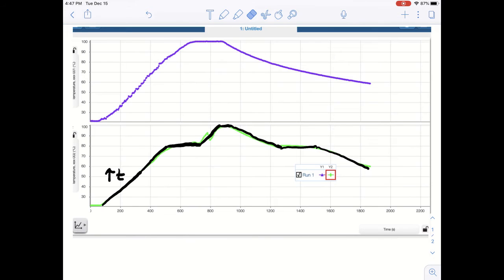But that's all thermodynamics stuff. So the motion of the particles is increasing, but we get to a point right here where the particles cannot speed up anymore and be in the solid state. So as we continue to pump energy into it through the water from the hot plate, the water keeps right on going because it's not undergoing a state change, but the substance, the particles stop speeding up. They cannot increase their speed anymore, and so they have to undergo a state change.